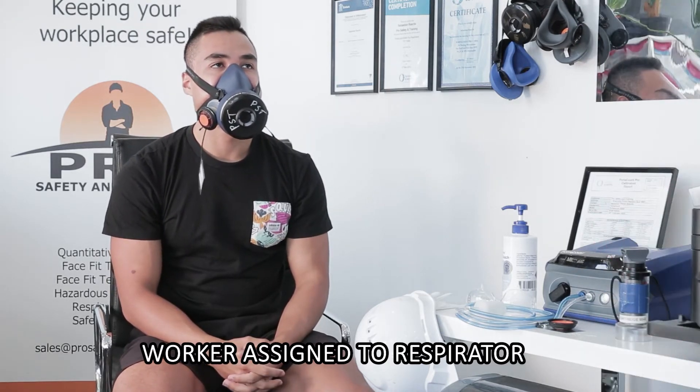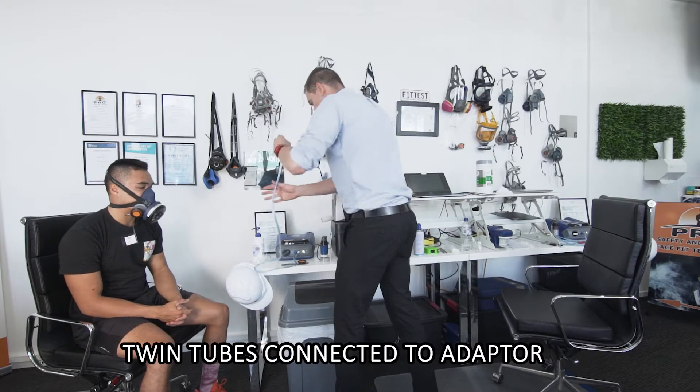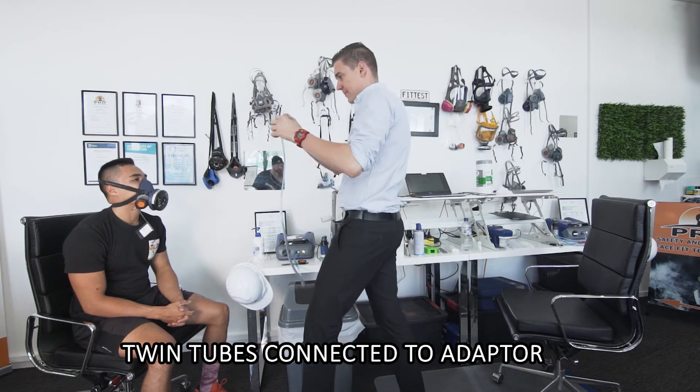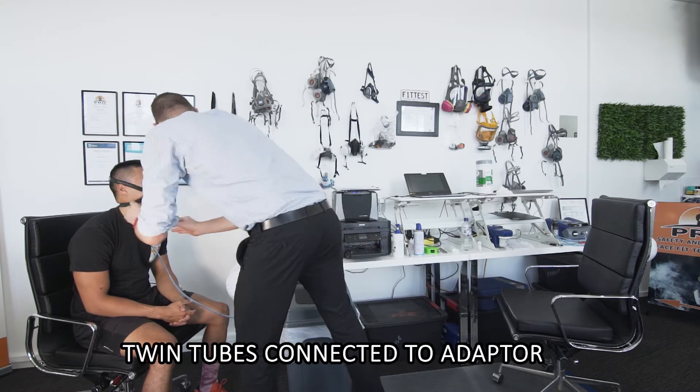So James, we're testing on a Sundstrom SL100 in a medium-large. That's basically it, nice and simple. I'm going to get you connected to the sample or the twin tubes — just plugged in here. Excellent, I'm happy with that.